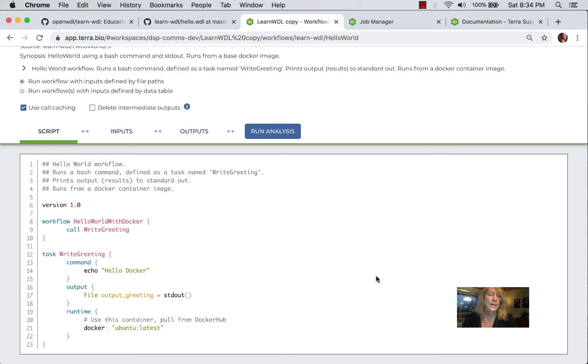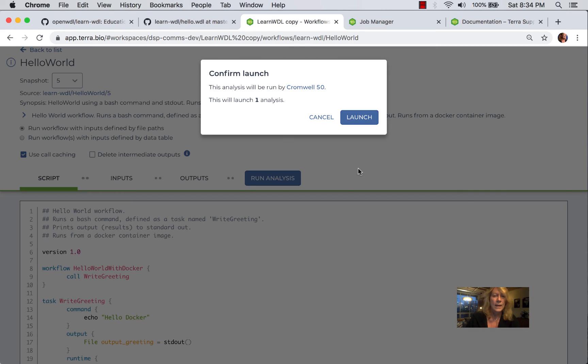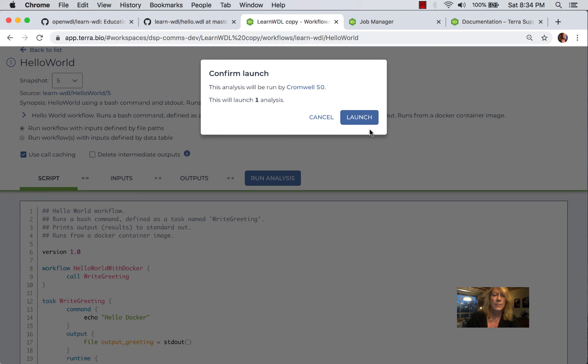I don't know if you can spot it. But if you can see in lines 19 through 21, rather than running directly on a VM or any group of VMs, we're now running on a Docker container. In order to run this, we click a blue button. And you can see that we have managed Cromwell. And we click launch.